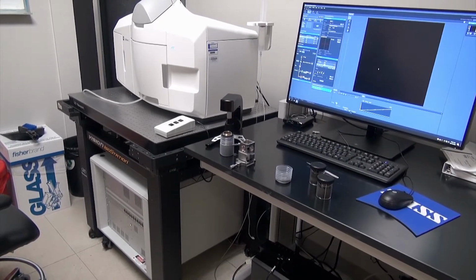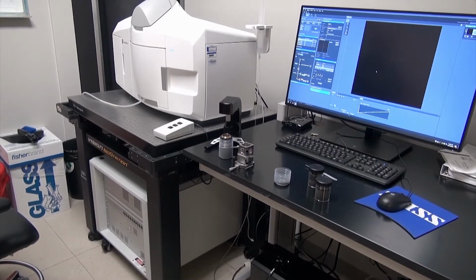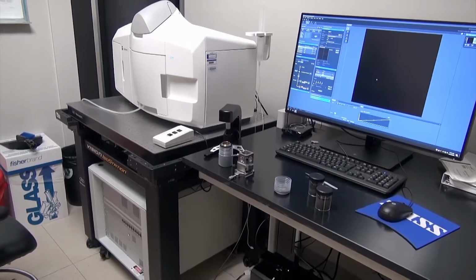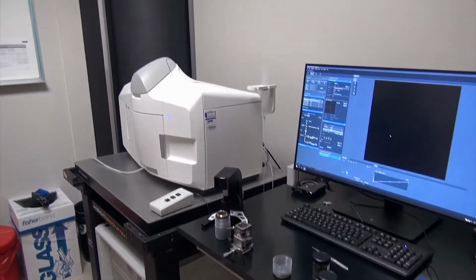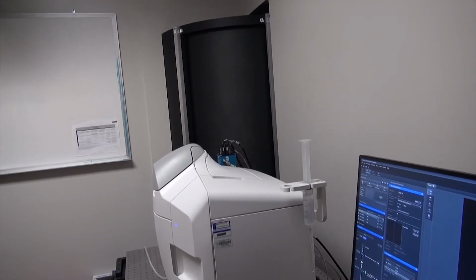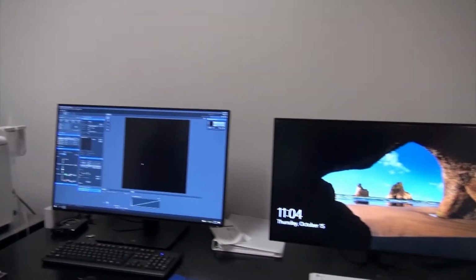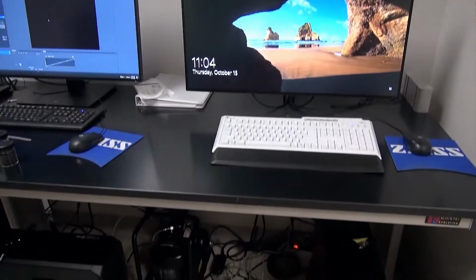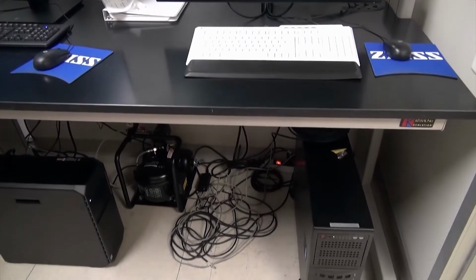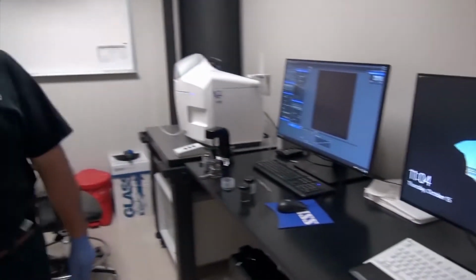We have 4 laser lines and a variety of filters for imaging on our 2 liquid-cooled PCO sCMOS cameras. In addition to the acquisition software, there is also an Imaris analysis software as well as a number of open source analysis tools installed on this workstation.